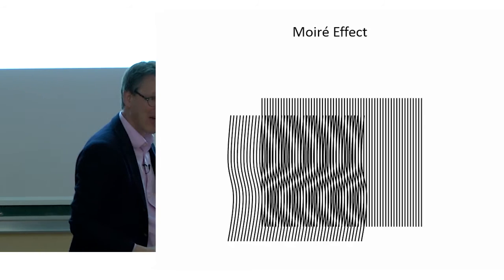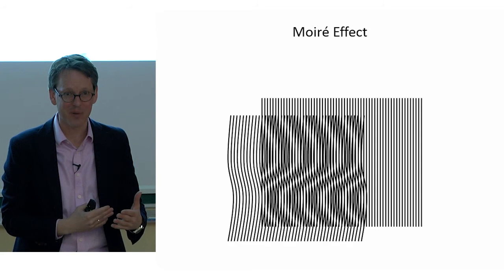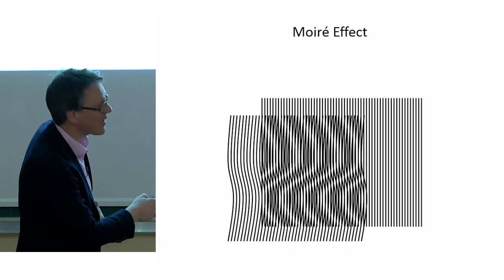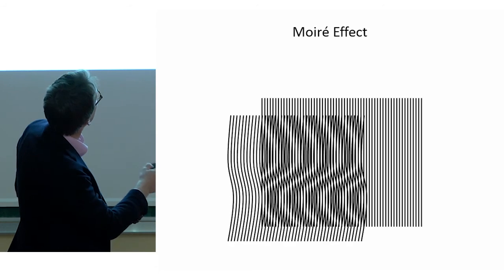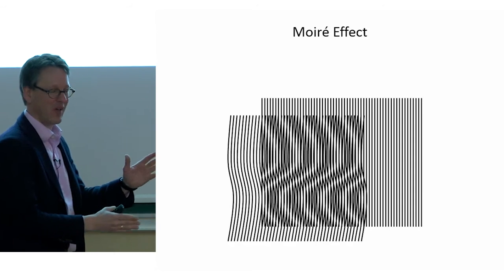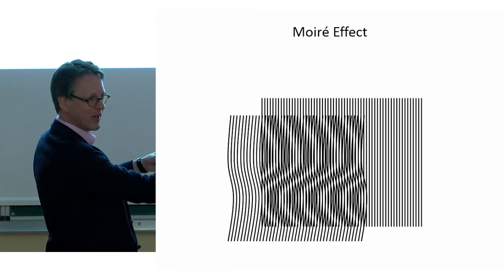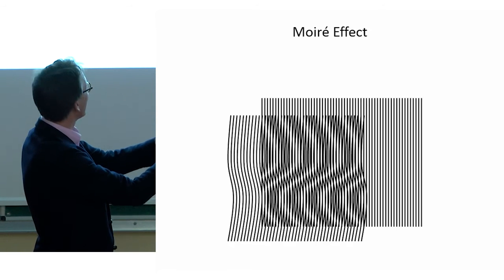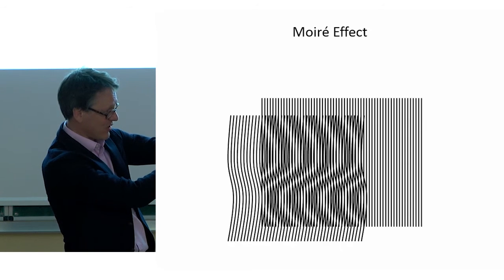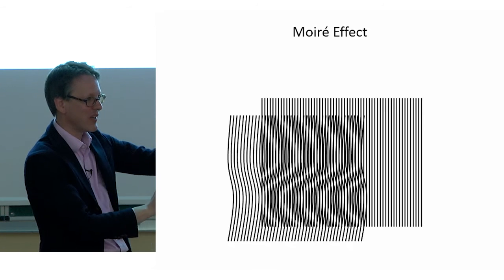And so this gives me now, in the Fourier plane, sum and difference frequencies of the spatial patterns. And the difference frequencies, you can see here, they're very low frequencies. They're called moire patterns, right? These patterns. You see them sometimes in curtains, if you have curtains that fold over, you don't see the small squares in them, because they're too fine. The mesh is very fine, but once they fold over, the meshes beat. The frequencies of these meshes beat, and you can see these low frequency patterns.